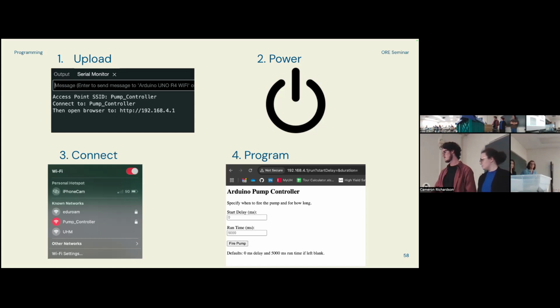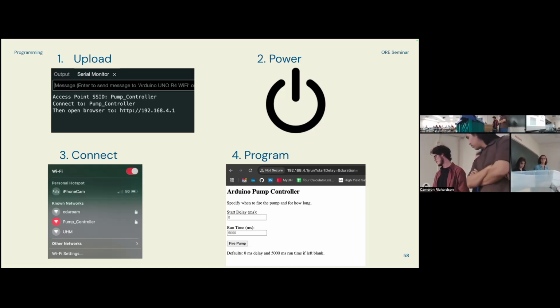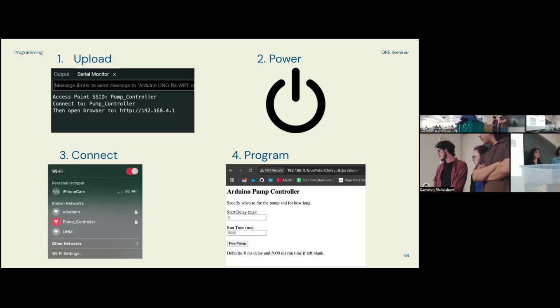We have one more Zoom question. You tried several filters of different porosity. Did you have a design requirement for a particular diameter cutoff, for example a filter at 100 microns and larger?